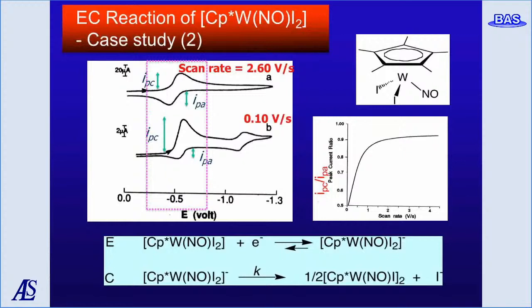The first cathodic peak current was higher than the second one. Furthermore, the reverse anodic peak is smaller, indicating the first reduction was accompanied by follow-up chemical reactions.